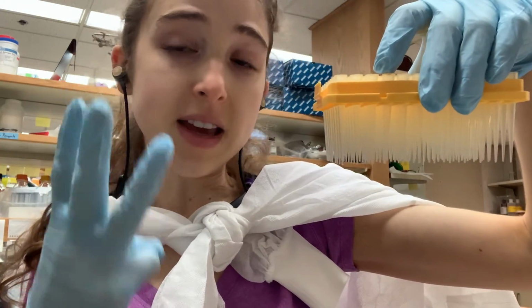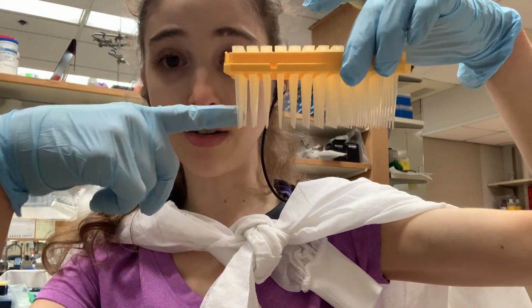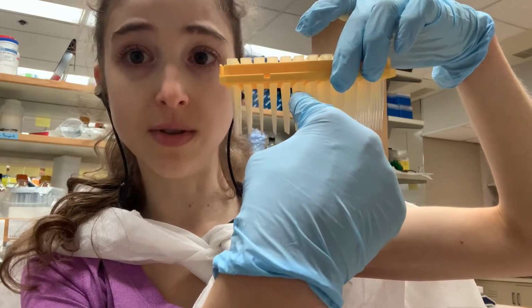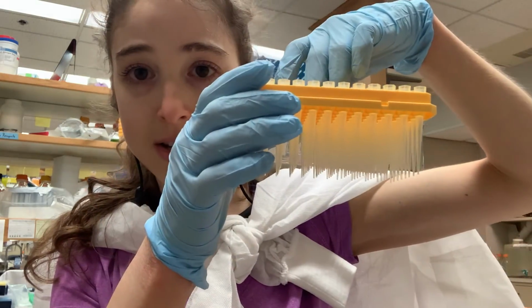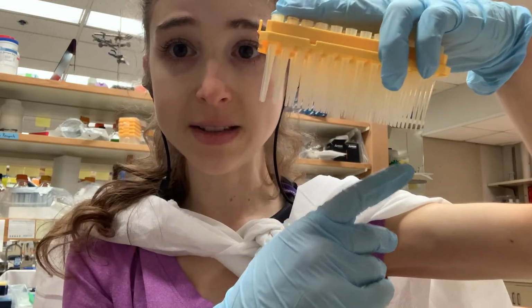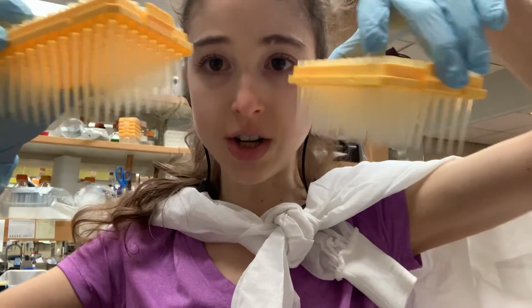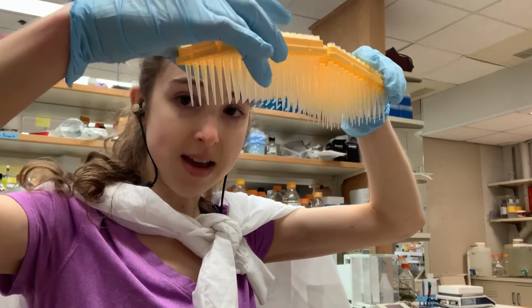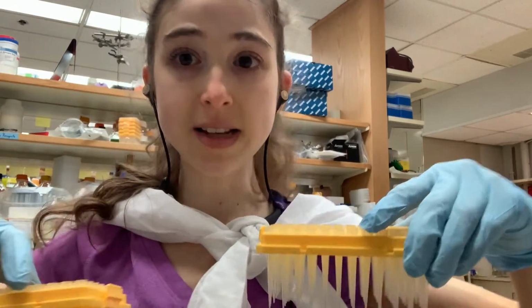And then the third thing is the path length. So you can think of, if I'm shining light through this way, it's going to encounter more of these than if I'm shining light through this way. And if I'm shining light through two of them, then you're going to have an even longer path length, and it'll have more opportunities to hit. So even though these have the same concentration, the same density of tips, if I extend the path length, I'm giving the light more opportunities to hit. So that's why the path length is going to matter.